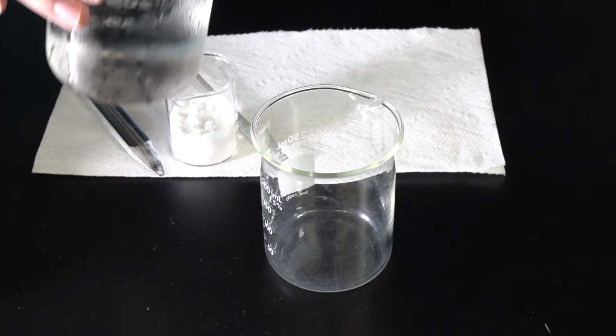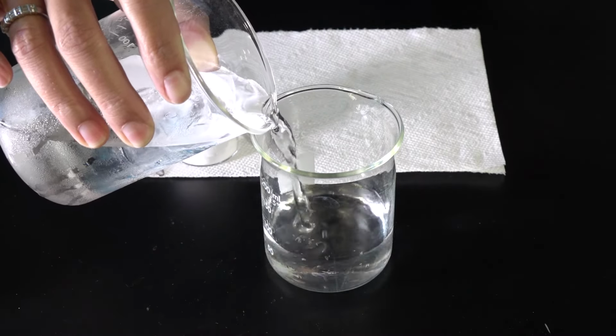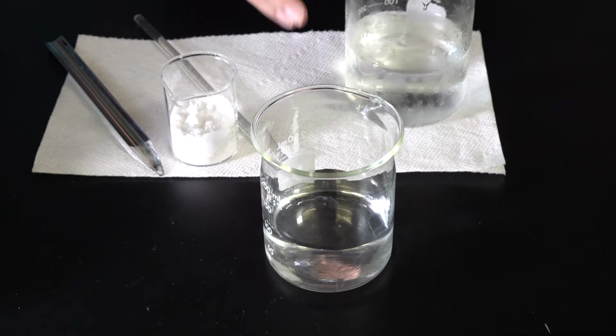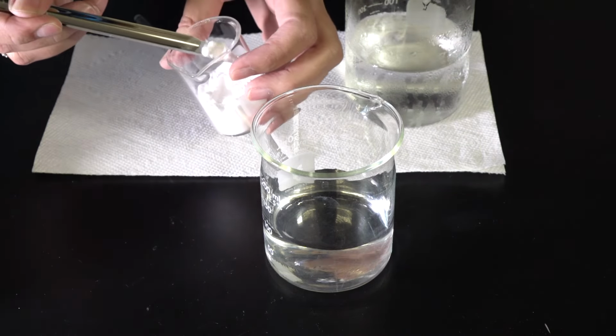Add 100 ml of water to the beaker. Add 1 scoopula of powder to the water and stir until it dissolves.